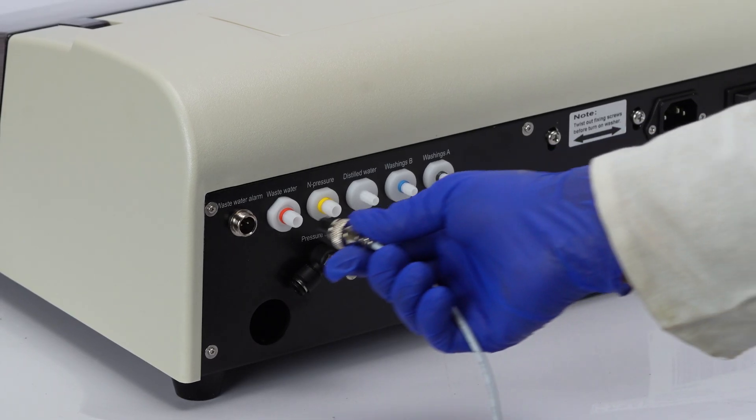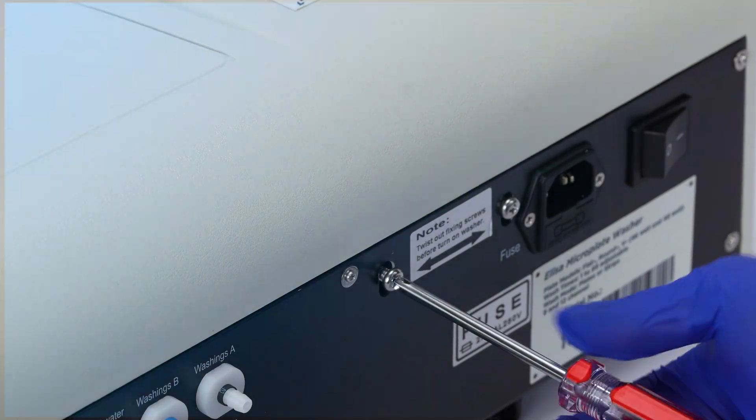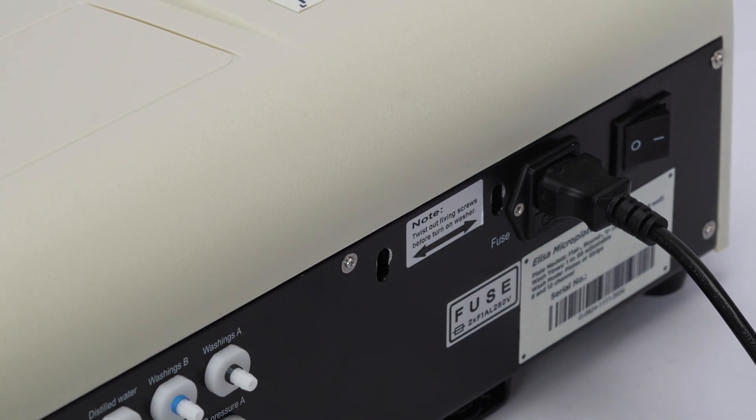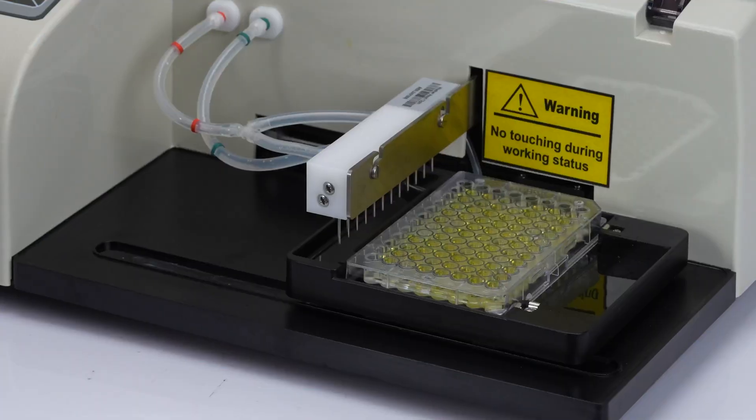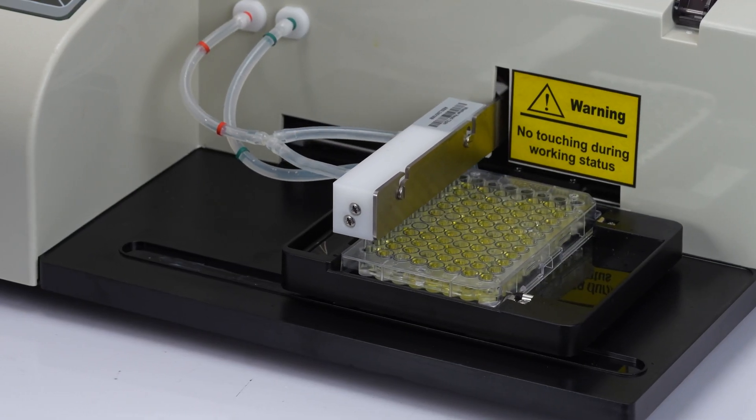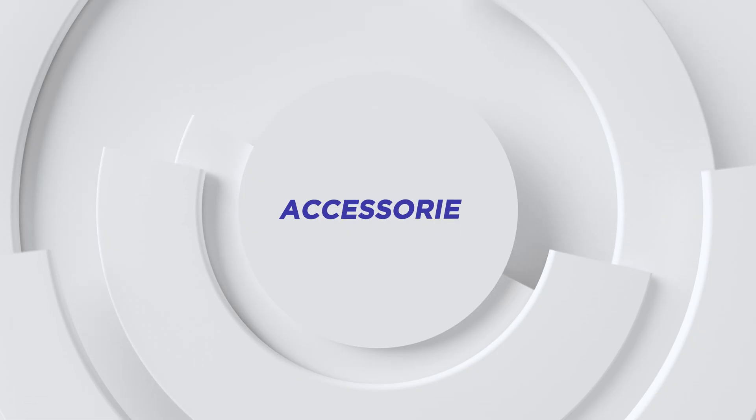Introducing the all-new Galaxy ELISA Washer EW812, a highly reliable instrument designed to meet a wide range of plate washing needs. It is compatible with both 96-well and 48-well plates, offering flexibility and precision for your laboratory applications.